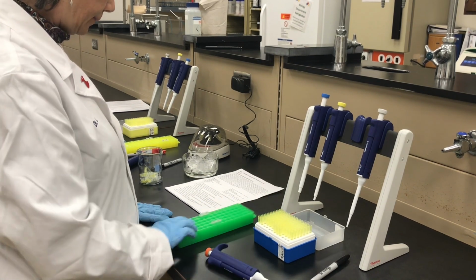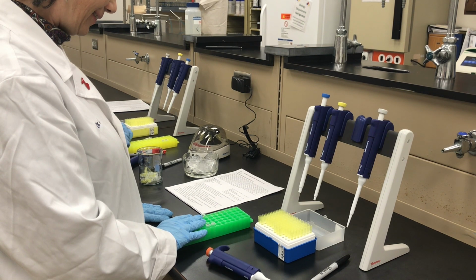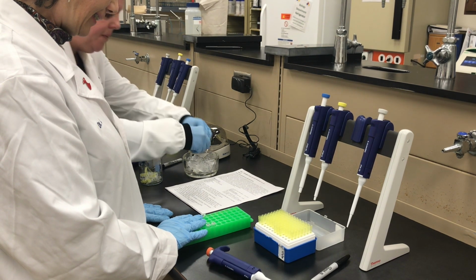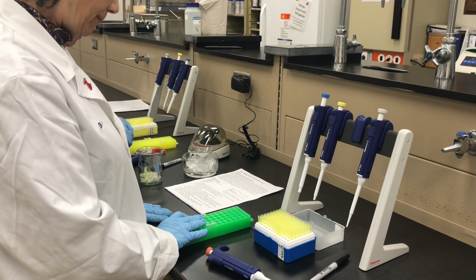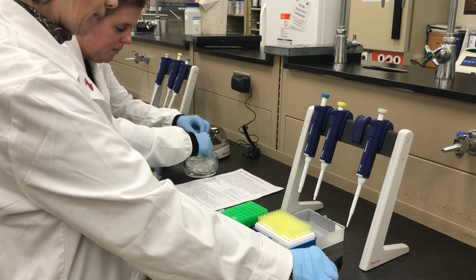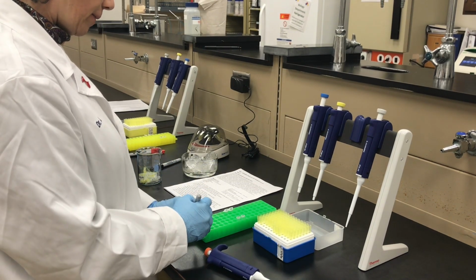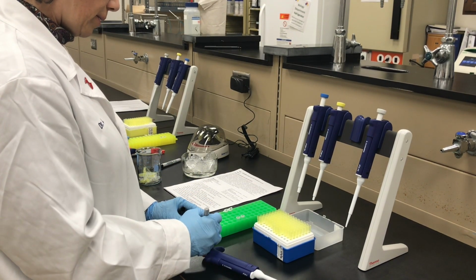Next, we're adding samples to the tubes. Okay, so I'm going to take 2 at a time out. I'm going to make a little note here: circle, triangle.